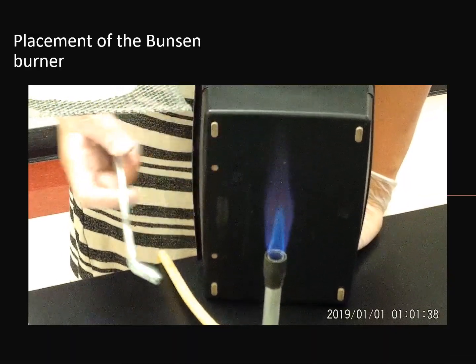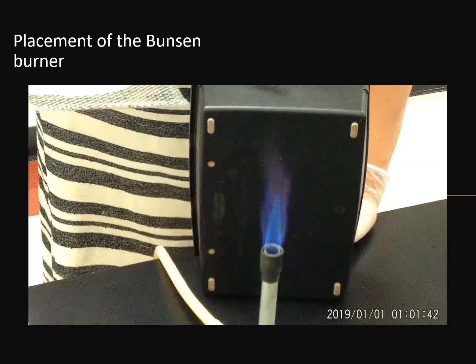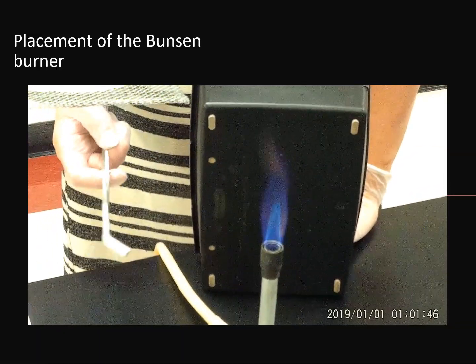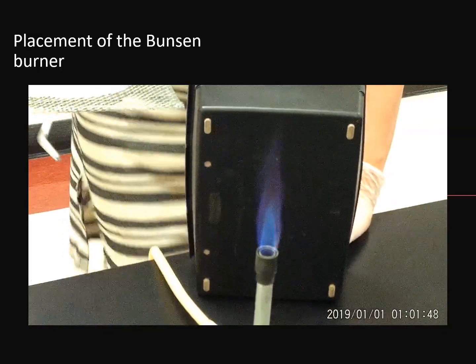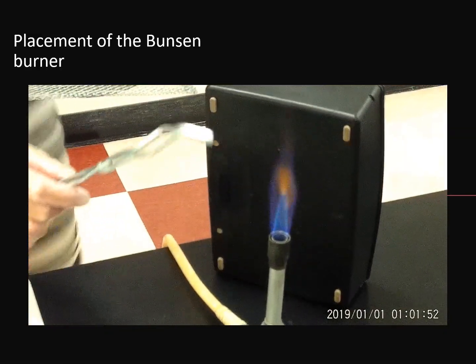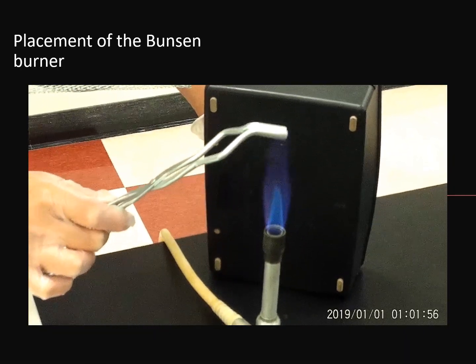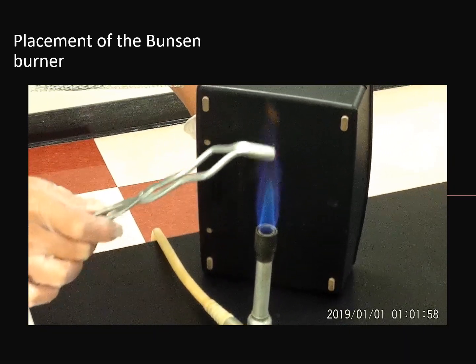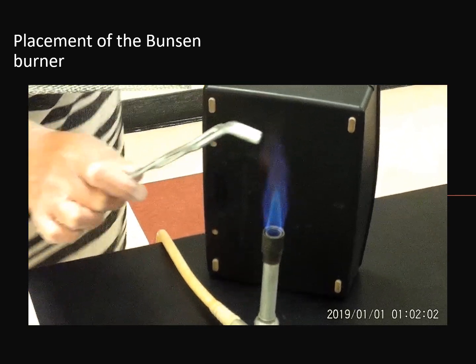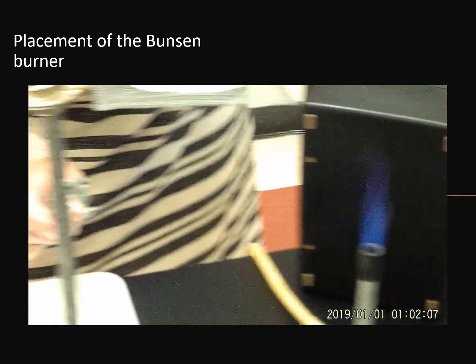So when you do this experiment, this is much too hot for your compound. If you have your compound in here, it's going to decompose with the oxygen in the air. So instead of the hottest part of the flame, it's cooler here, so we're going to get it closer to the top part of the darker blue flame. So what we're going to do is say, this is my flame, it's around here.